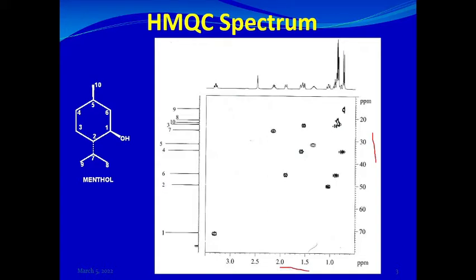Unlike the COSY spectrum, which had a diagonal going right across the spectrum, the HMQC spectrum does not have any diagonal. It just shows contours which we have to connect on both the carbon-13 and the proton NMR scales. For reference, the proton and the carbon-13 spectra have been plotted on top and on the left-hand side of the spectrum.